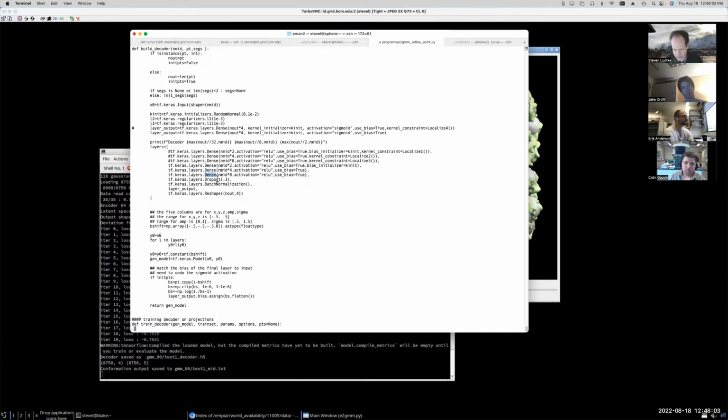So 3 dense layers basically meaning that every neuron in one layer is fully connected to the neurons in the next layer. And then there's a dropout layer, which will arbitrarily set certain weights to 0. And then there's a normalization layer, which makes sure none of the numbers are getting out of the range of the numbers that the network can handle. And then you have an output layer, which is the result.